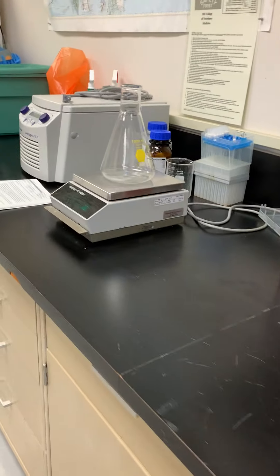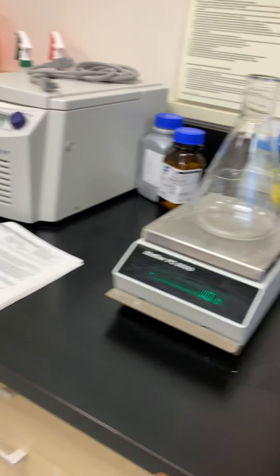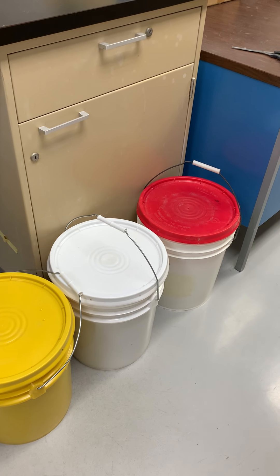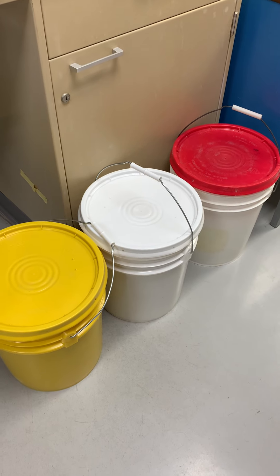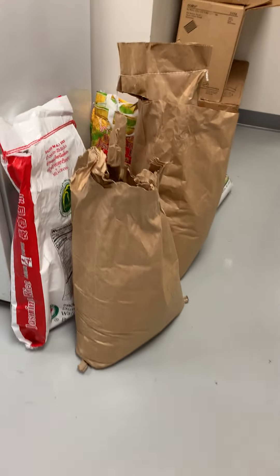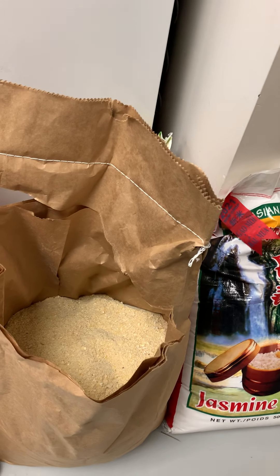We have a balance to weigh out the rice. I have lots of aflatoxin culture here now — I just blended this morning with my lab tech. This is fumonisin, and this is aflatoxin. Here is the rice we used for the culture, and here is the corn.